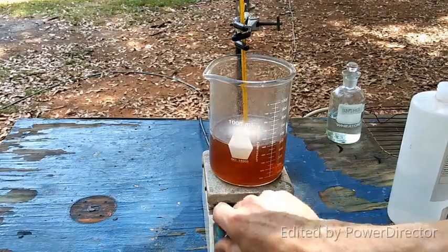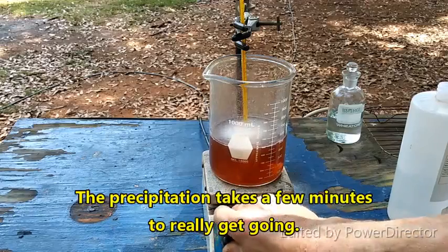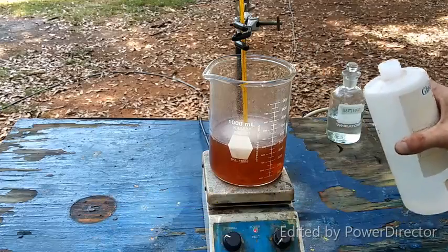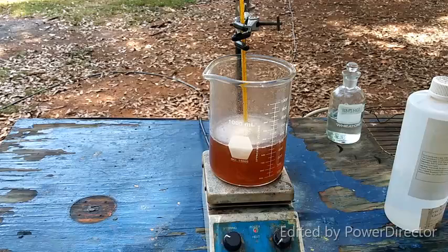Yeah, I don't think that's solids. That's just fizz. I don't know, it's getting cloudy. Now, ChemPlayer did mention that it would take a few minutes to precipitate out, so I'm going to stop here. I'm going to let this just stir for a little bit, and I'm going to see what it does.